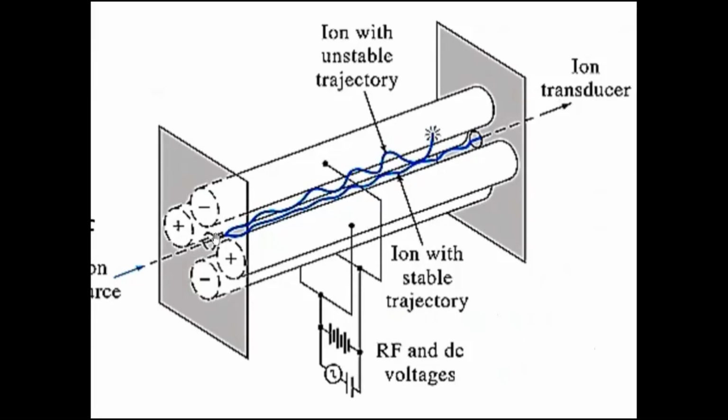Now because it is very high, when small ions are going, when they reach this negative rod, immediately that negatively charged rod becomes positive. So it will change its path and go to the immediate next negative rod. By the time it is getting near that negatively charged rod, that too becomes positive. So it will repel. So it will spiral its way till this opening and escape the quadrupole.